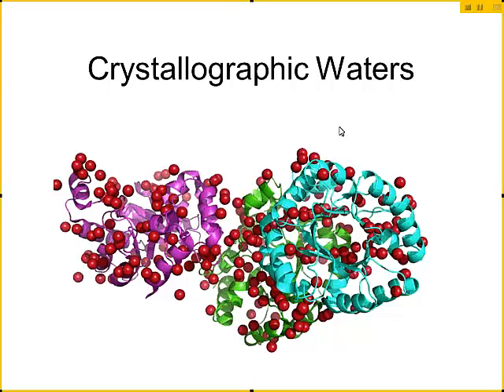Some of the atoms that show up as hetero atoms are crystallographic waters. Now, you're only going to see water molecules in a crystal structure. And those are water molecules that become associated or hydrogen bonding with side chains in the molecule or backbone atoms. And you see those little red dots here. Those are all the oxygen for your water molecules. Now, remember, I said at most resolutions, you're not going to see hydrogen. So of H2O, all you see is the oxygen for your water molecules. Those show up as het atoms. Most of the time, these are not important.